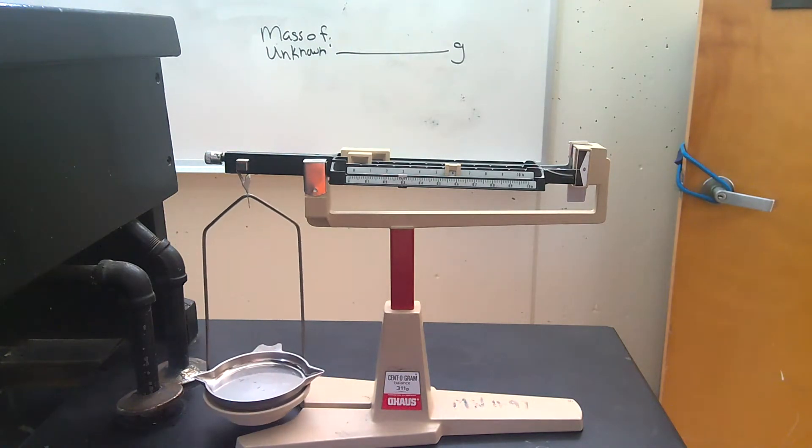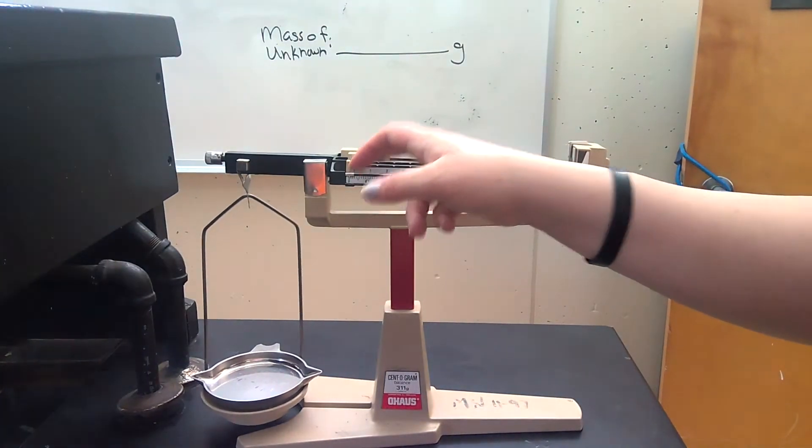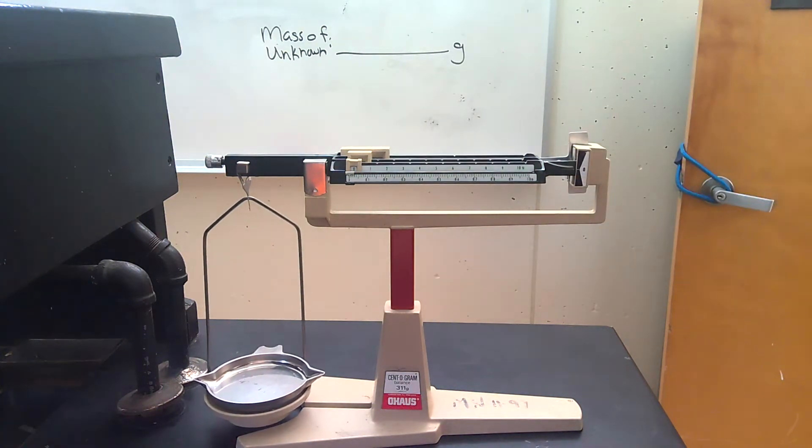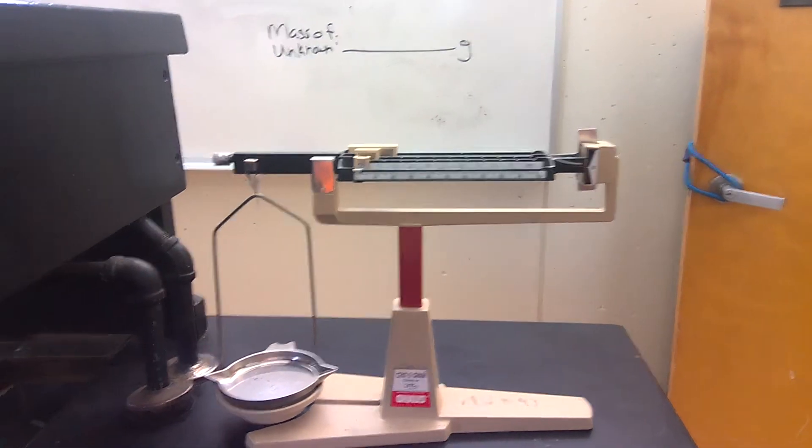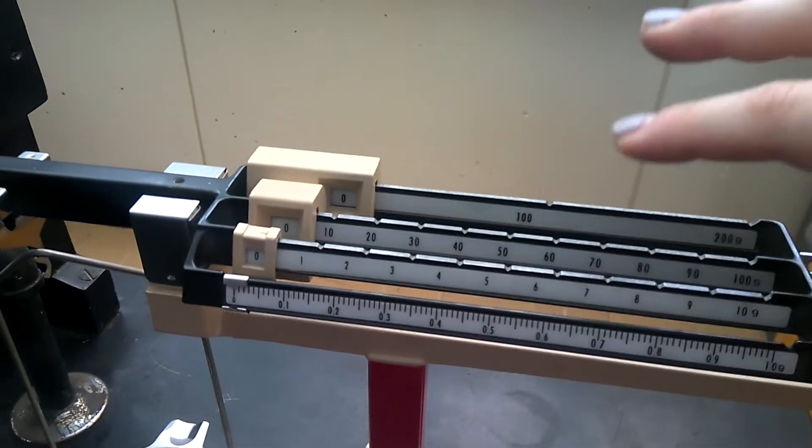So the first thing is we need to make sure that our quadruple beam balance, which is what we use in chemistry to find the mass of an object. To find mass, we use the unit measurement of grams. This is called the quadruple beam balance because quad meaning four, there are four riders.